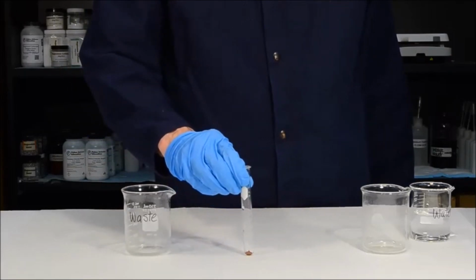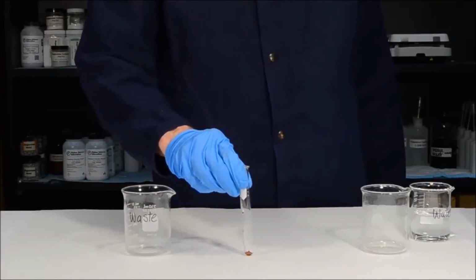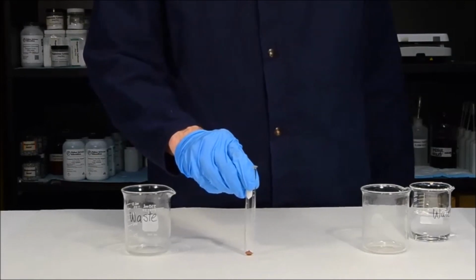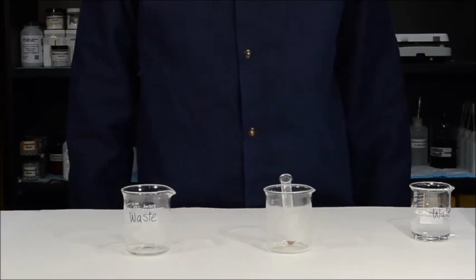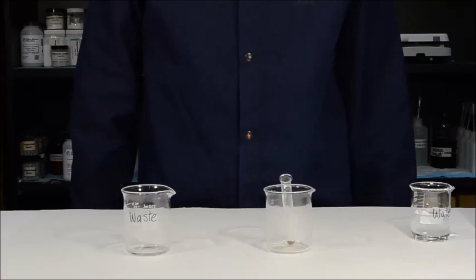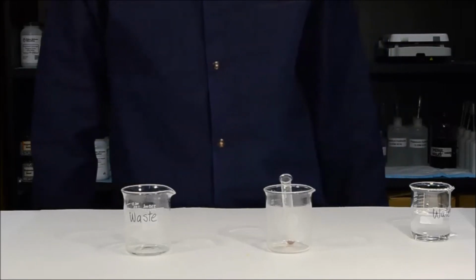Once you've decanted the solution, you're going to want to place the test tube in the oven for approximately 15 minutes in an attempt to dry the copper metal. After 15 minutes in the oven, you simply want to record the mass of the copper metal and the test tube. Then you can perform your calculations.